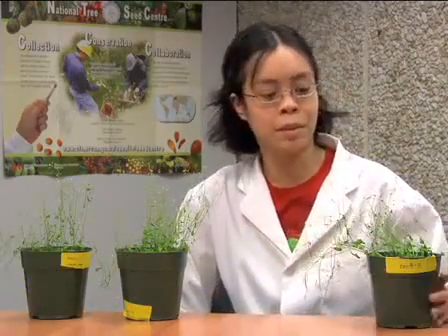Hi, my name is Patricia from the laboratory of Ljerka Kunst at the Department of Botany at UBC. Today, myself and others are going to show you how these plants, Arabidopsis, can be studied to understand how plants make cuticular wax. I'm Miao from Reinhard lab at UBC. I'll be showing you how we analyze chemical composition of cuticular wax using gas chromatography. And I'm Allan DeBono from the laboratory of Lacey, also at the UBC, and I'll be showing you how we analyze the crystal structure on the surface of Arabidopsis using cryo-scanning electron microscopy.